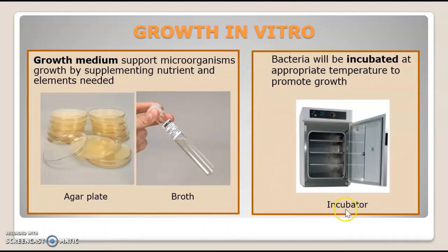The commonly used temperature in an incubator is 37 degrees Celsius. Usually, your cultured bacteria will be left in the incubator overnight or at least 12 hours to observe if there is any growth.